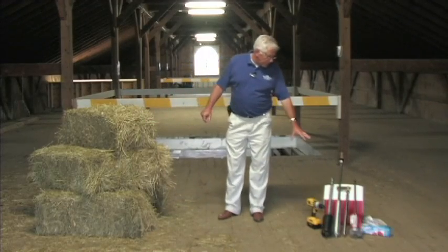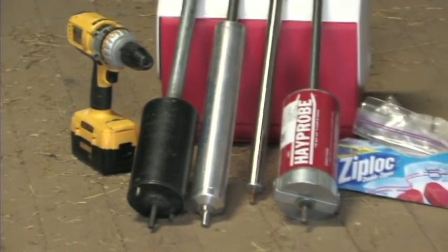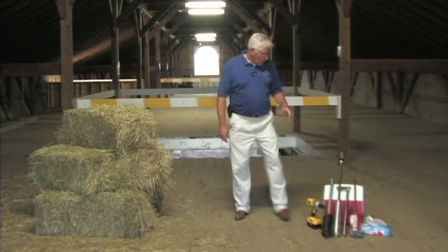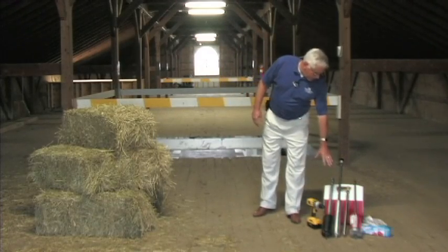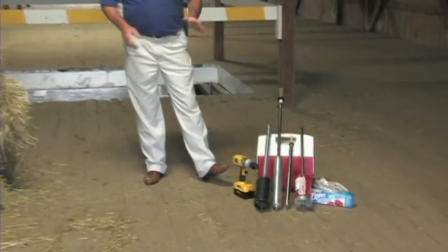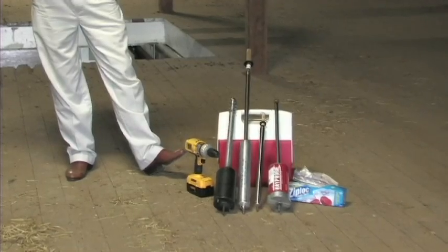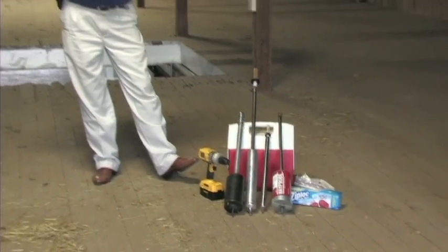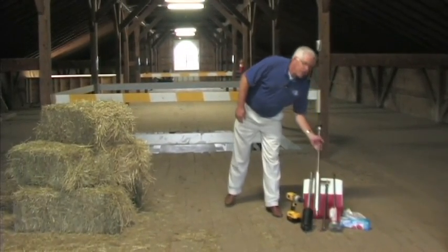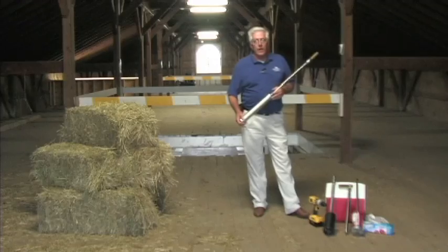You'll see here with me today I've got several different types of probes. You can purchase them online or at most any ag feed store. We have the Yankton hay probe, the Colorado State, the Penn State, and the HMS. Any of these probes will do a good job when sampling hay — it's really a matter of personal preference. We're going to demonstrate the Colorado State probe today, but any of these probes will do a good job in testing your hay.